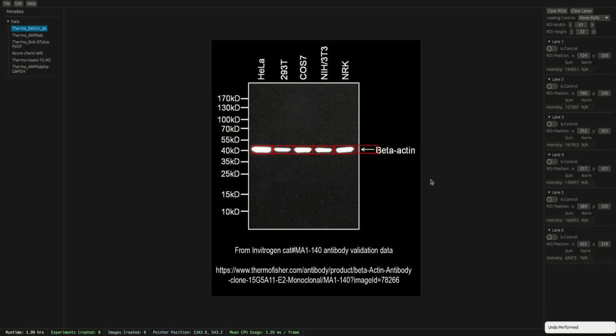You may wonder in the background what's going on because these actions keep getting undone. I'm using the keyboard shortcuts for undo and redo. You can do Control Z to undo and Control Shift Z to redo. If you're not happy with the keyboard shortcut, you can just go to the edit menu and click those actions. I am choosing to do that just so I can demonstrate these actions back to back.